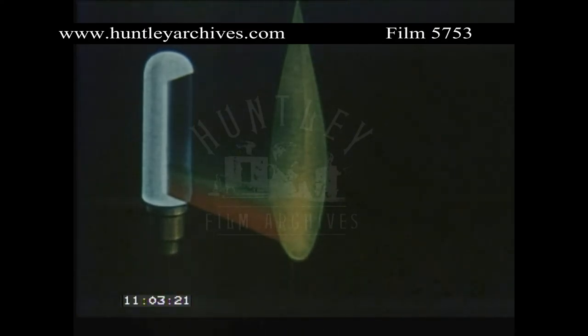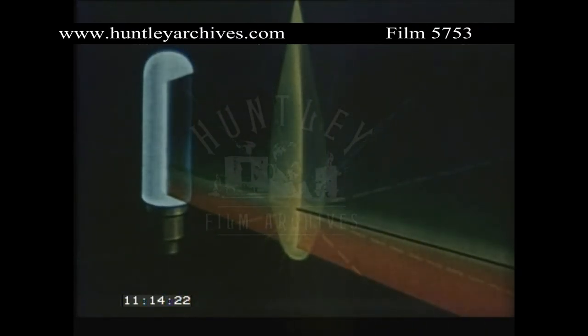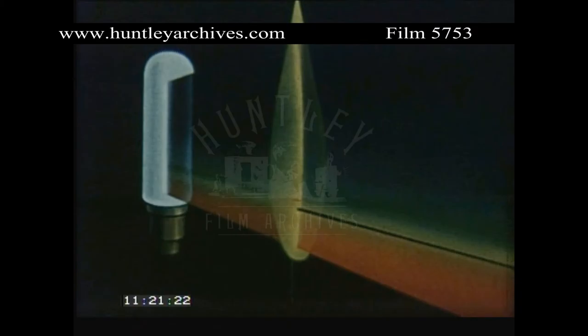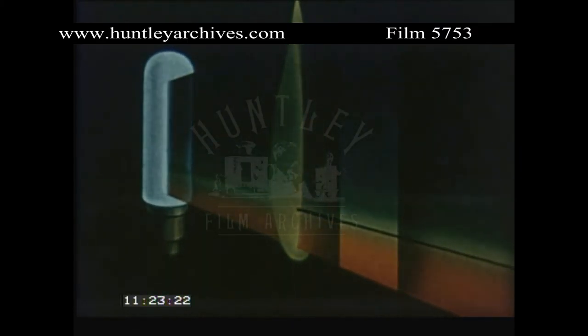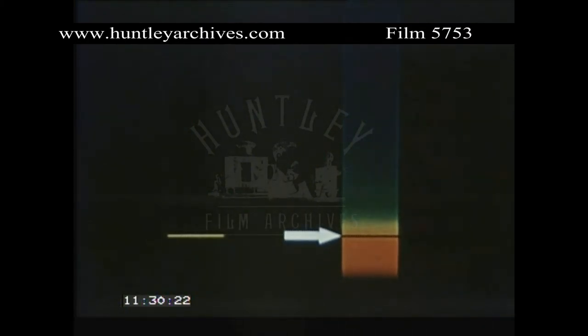This re-radiated light is scattered in all directions, while the unabsorbed light passes straight through with unaltered intensity in its original direction. Virtually none of the absorbed light reaches the collimator, thus producing an absorption spectrum.